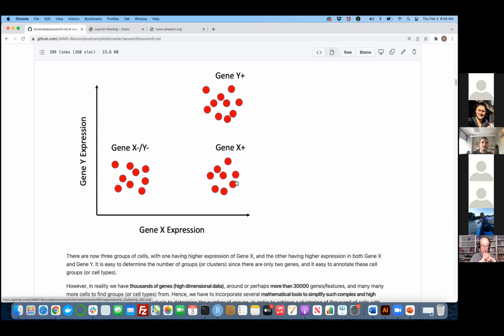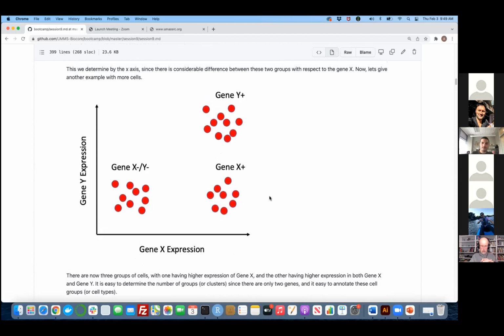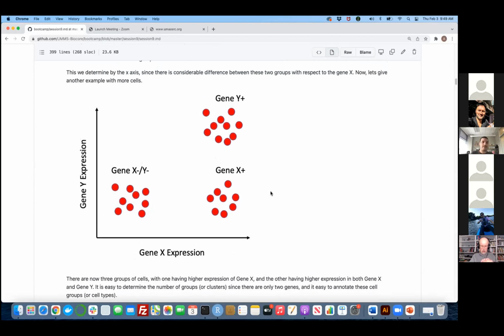Yes, David. Oh, Kashi, go ahead. So when you're labeling the cells in single cell, it's not automated. It's something for the annotation. You have to do it by yourself. Yes, exactly. So again, you have to test for the markers. You have to see if the gene is up or down. So it's up to you now. You're making that judgment a little bit.